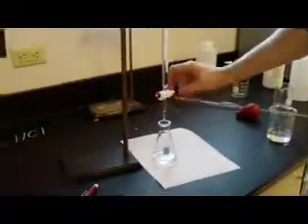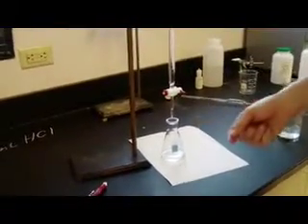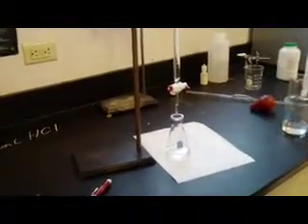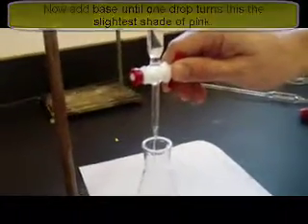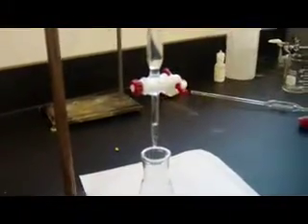I'll lower my burette so it's nice and ready to go. And what I'm going to do is I'm just going to start to dispense some of the base into the acid until it turns pink. Now, you don't want to overshoot this. You want it so it just, with one drop, it turns and stays pink. Now, there's a few ways we can do this. You can just turn it on and let it run, but that's just a great way to overshoot, because you don't really want to do that, okay?